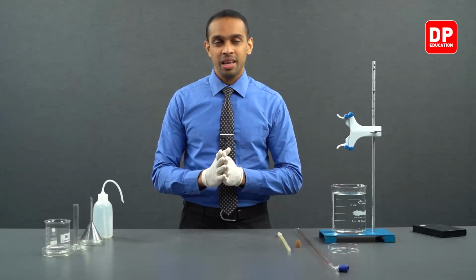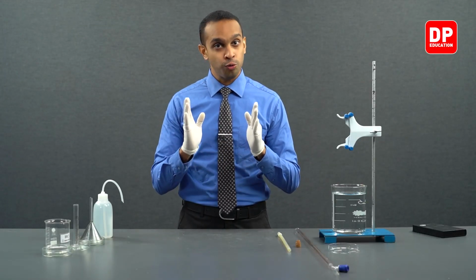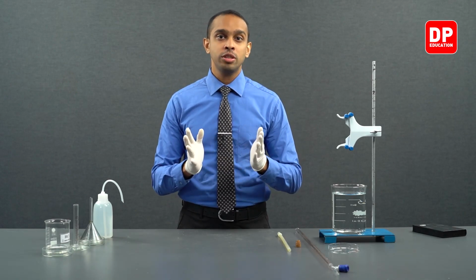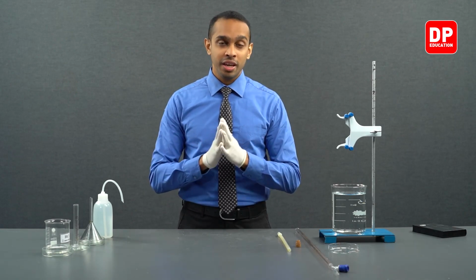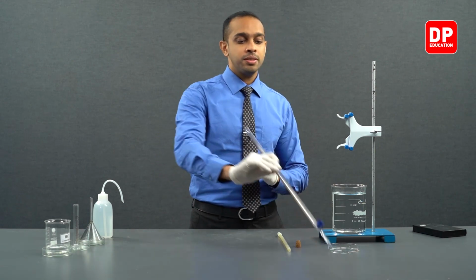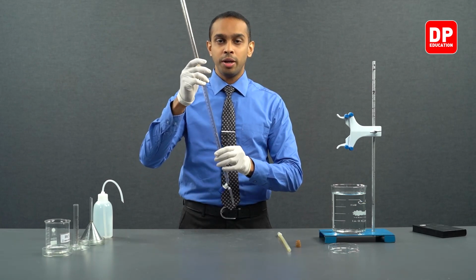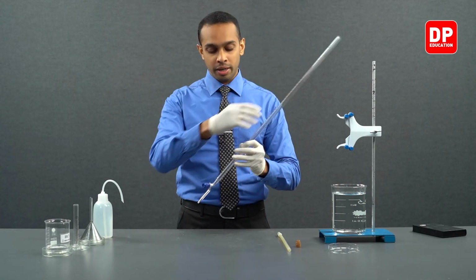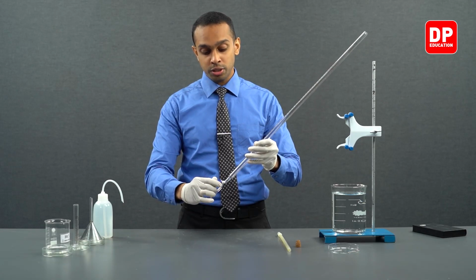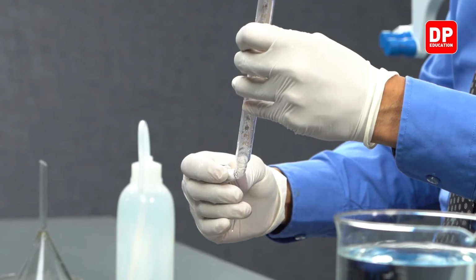Now, let's add 5 cubic centimeters or 5 milliliters of 2 moles per decimeter cube HCl into our burette. We have our burette that is washed with distilled water here, and we are going to make sure the burette is properly closed because we are dealing with concentrated HCl acid.